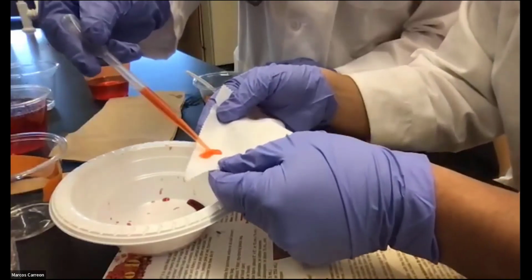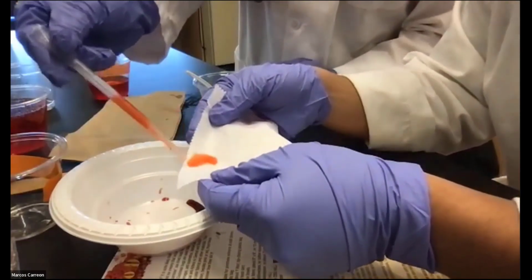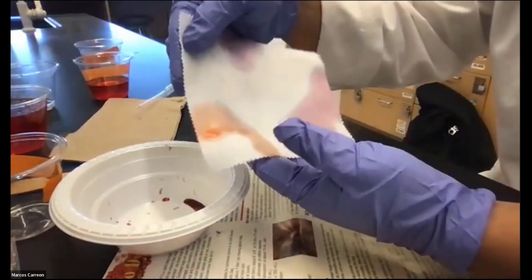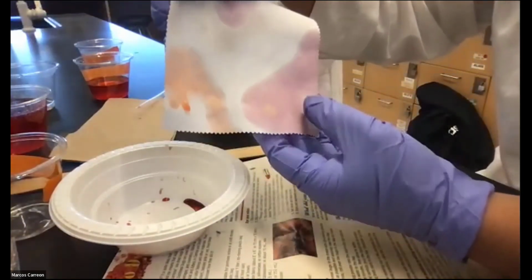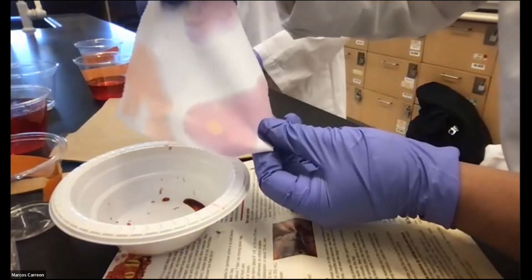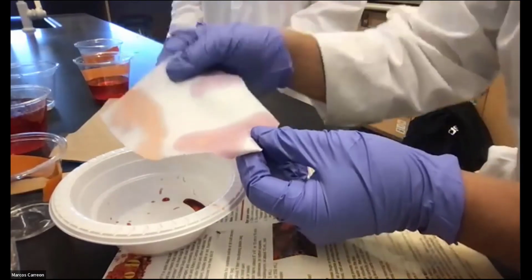But if you were to add an additional solution, pretty much a blue solution. But how it works, in chemistry, we do use dyes a lot to make sure we can test if we have an acidic or basic solution. Oh, I kind of just spilled that on myself.